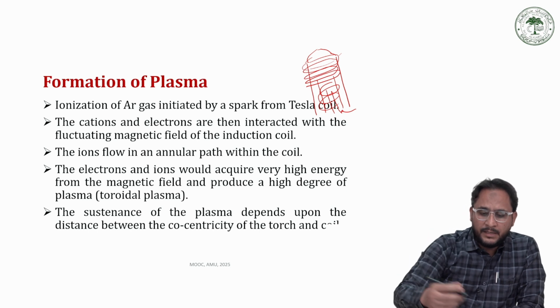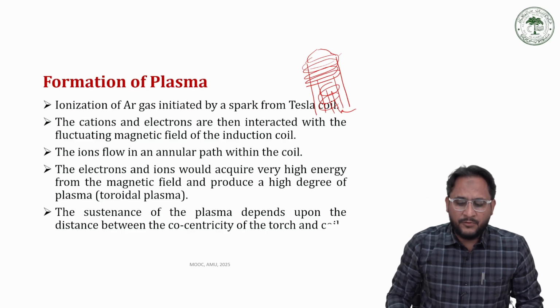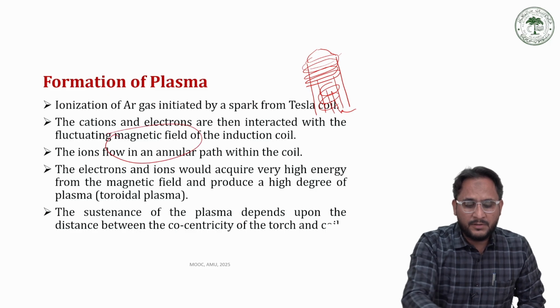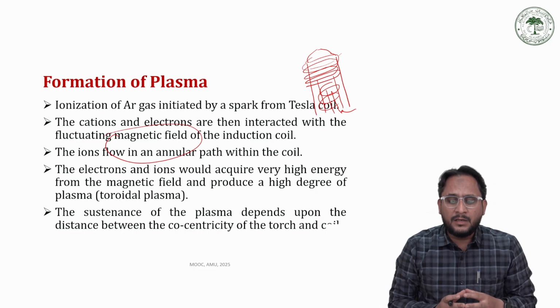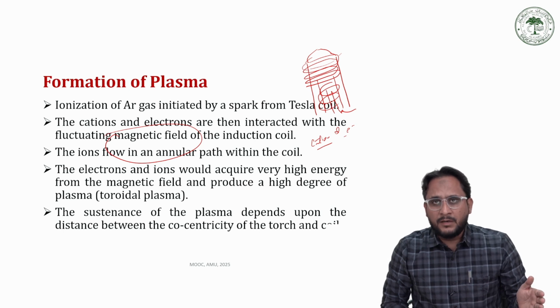The oscillating magnetic field of this radio frequency provides excessive energy, which is sufficient to convert argon gas into its cations and electrons.